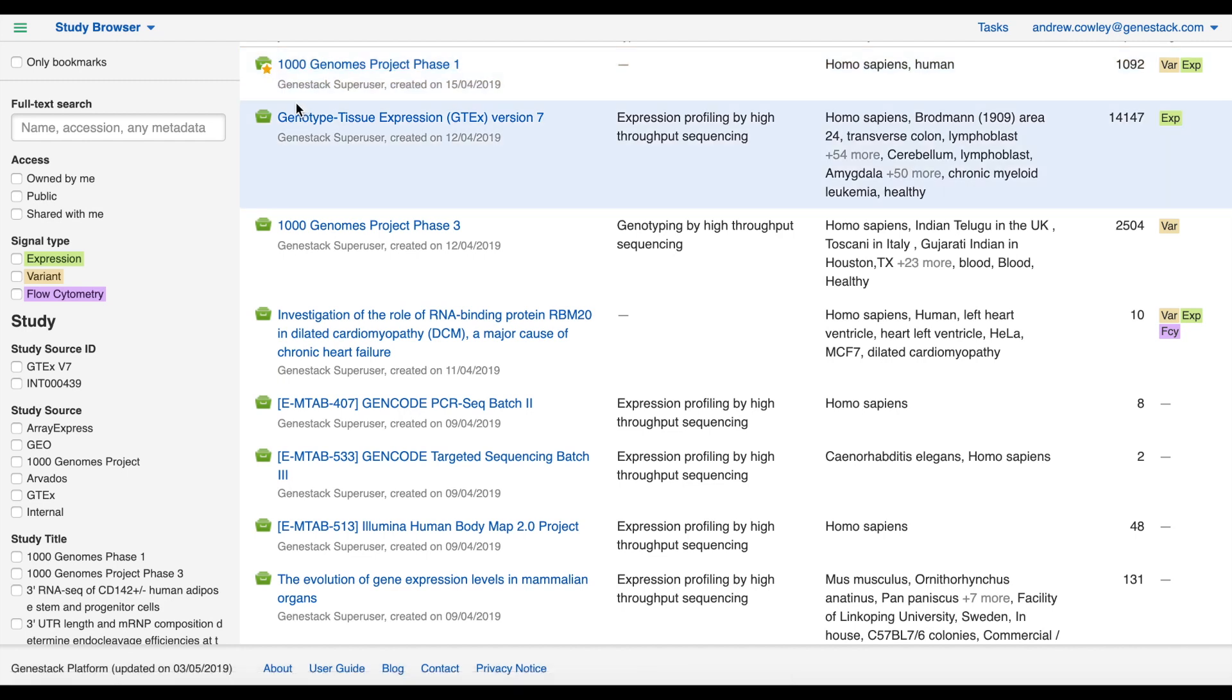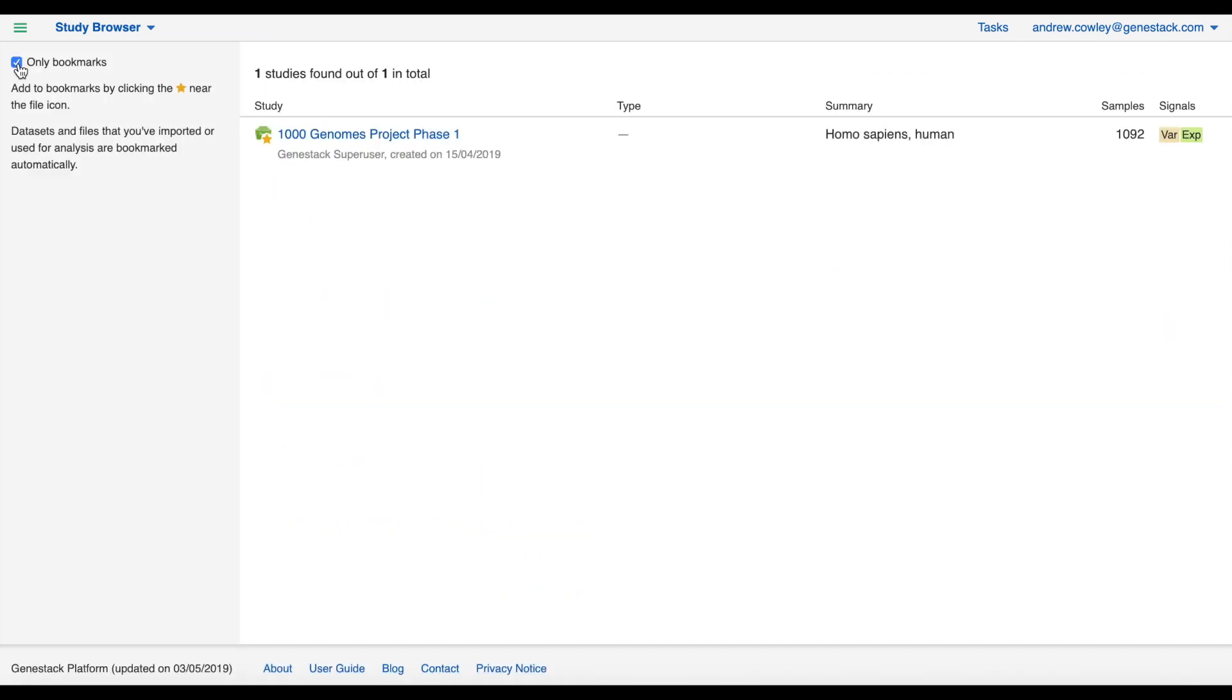If you hover over the file icon you can also see a small star. You can click this to bookmark a favorite study, and not only do you get the little visual indication of this, but you can also tick the only bookmarked option to quickly view your favorite studies.